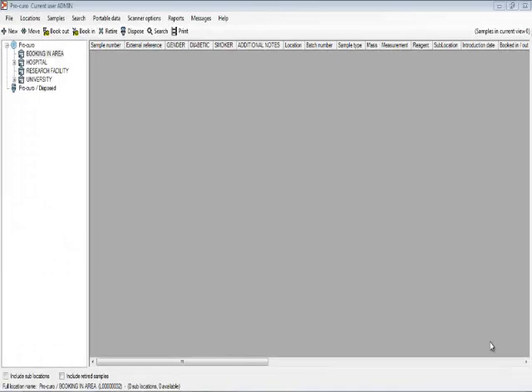Hi, and welcome to the tutorial on adding samples. Before I go through this, I want to firstly show you how to edit the user fields.